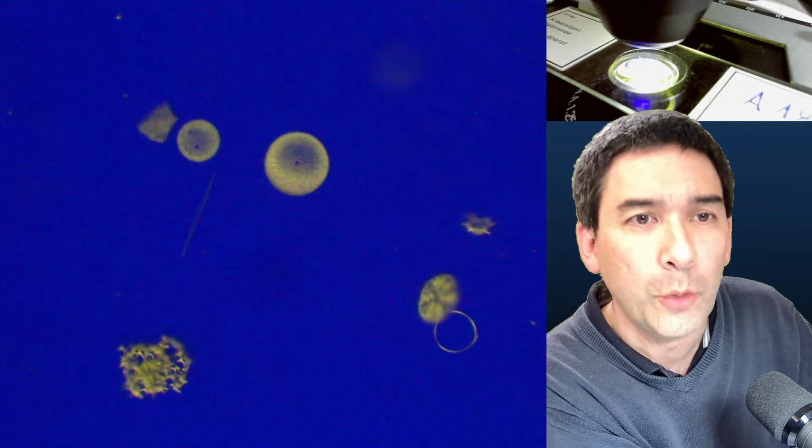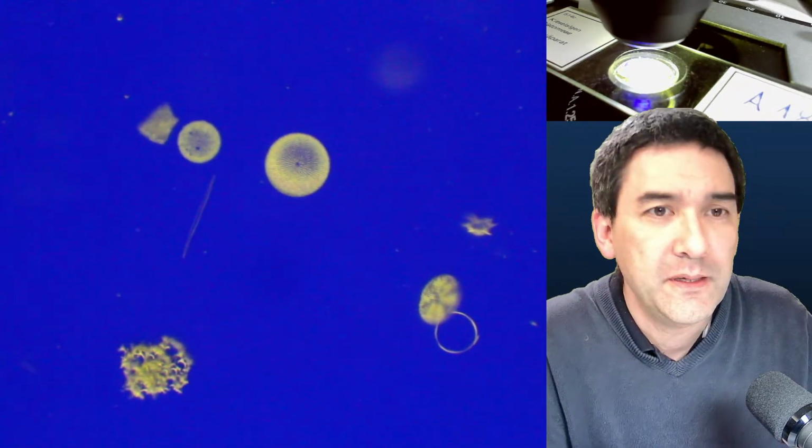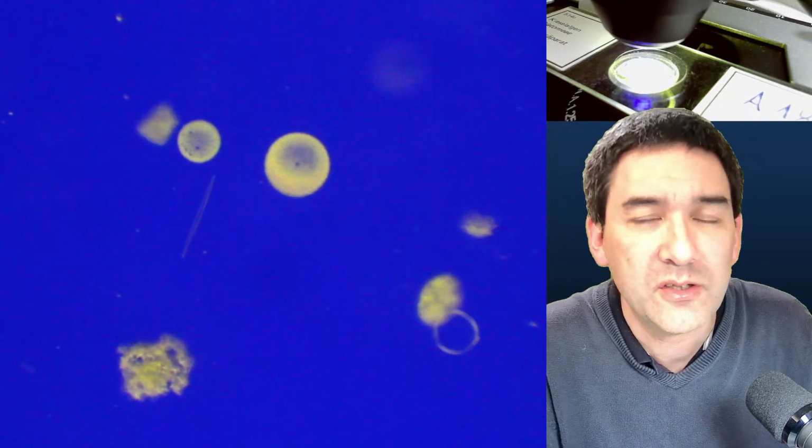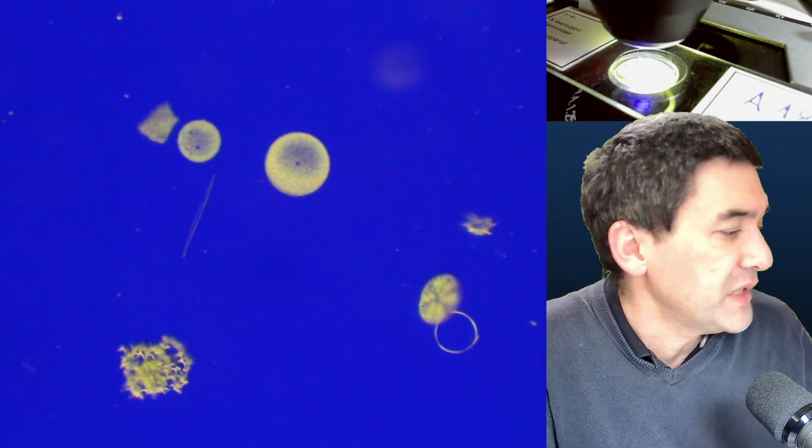So it's called optical staining, and of course it is quite nice to get color into it if you're not able to use chemical stains. Why not? Because chemical stains, of course, sometimes destroy or kill a specimen.